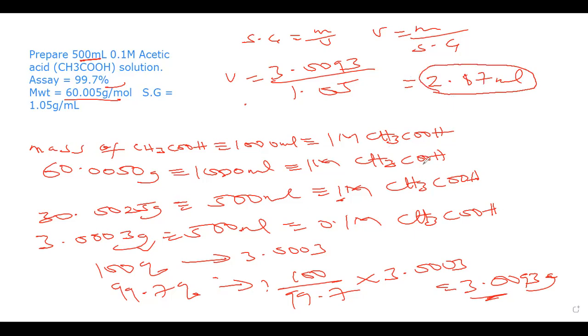So it means I will go and take this amount of the stock solution of the acetic acid, then fill my 500 ml volumetric flask, probably to the half mark, and add my acid. Now I'm filling in water before adding the acid, because we don't add water to acid, but we add acid to what? Water, to ensure even distribution of heat, right?